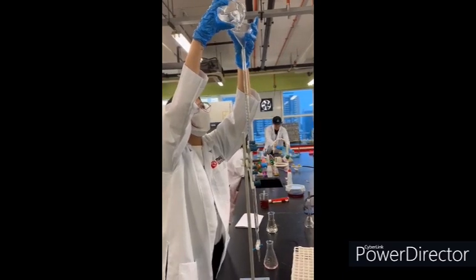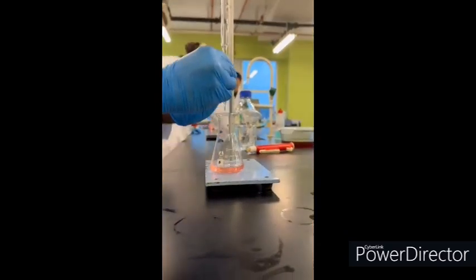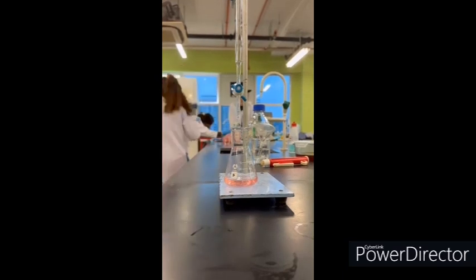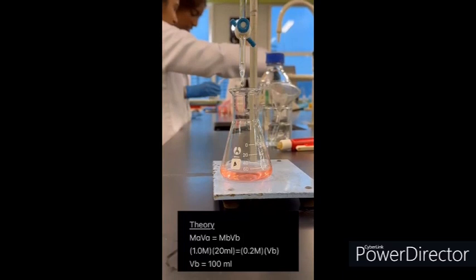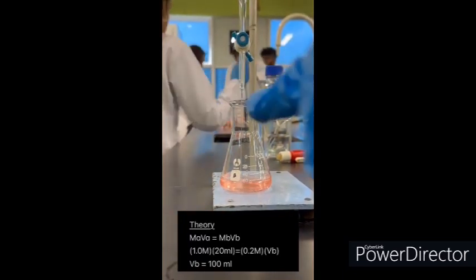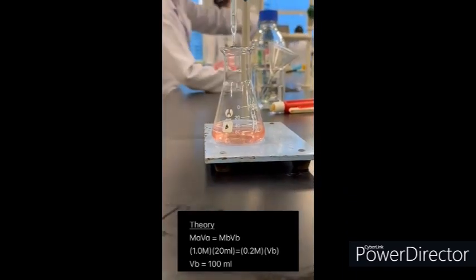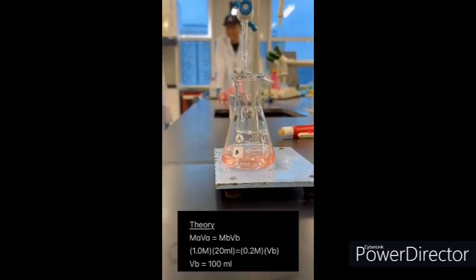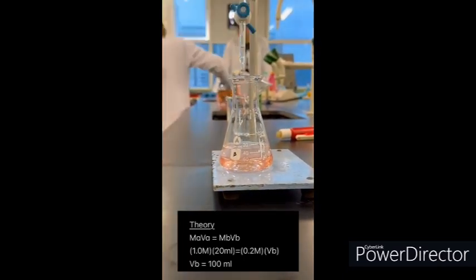For the second sample, the same substance and method were used as the first experiment to get a more accurate result. Since the molarity and volume of acid and base are known, we can calculate the volume needed to achieve the neutral state, called the endpoint. According to the figure shown, the hydrochloric acid has a molarity of 1.0 molar and the sodium hydroxide has a molarity of 0.2 molar. Since the volume of acid used is 20 ml, using the formula M1V1 = M2V2, the volume that should be used is 100 ml for the sodium hydroxide.